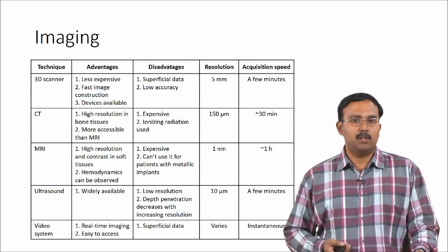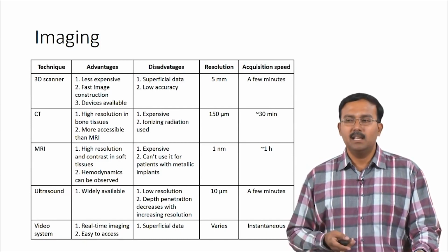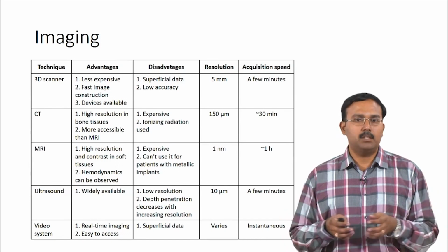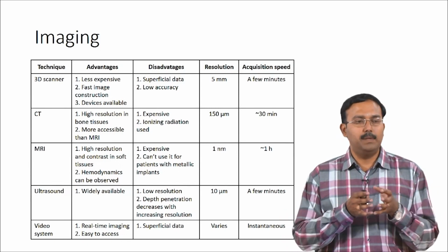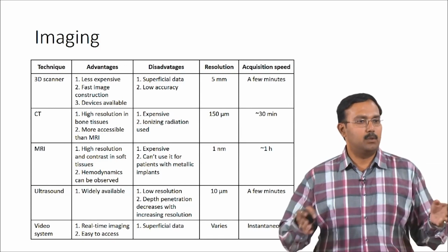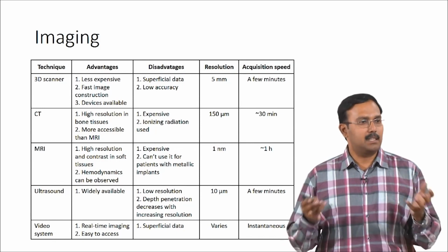Video systems have also been tried. Real time videos and images are processed: you take the superficial data, process it, and try to build a 3D structure out of it. So the image processing aspect plays a major role in constructing the 3D structure.